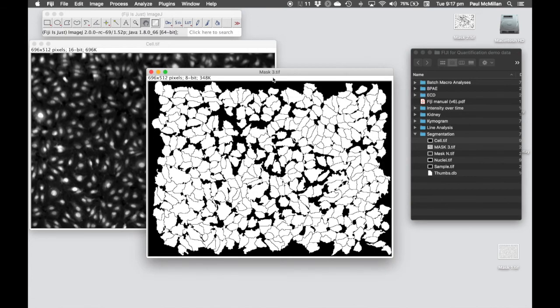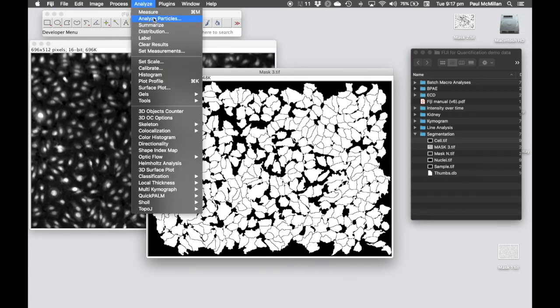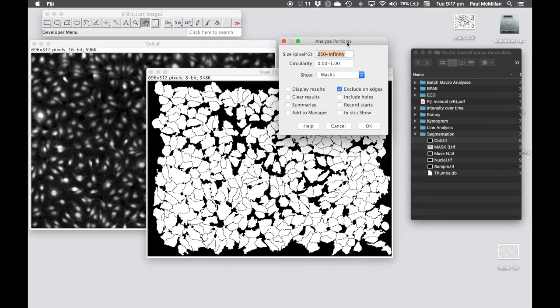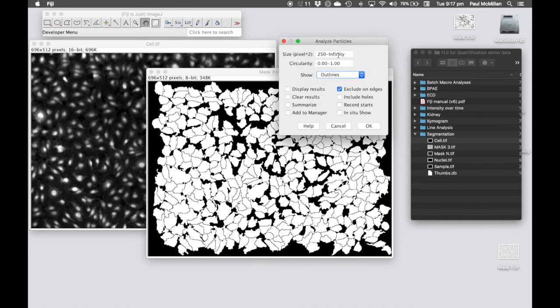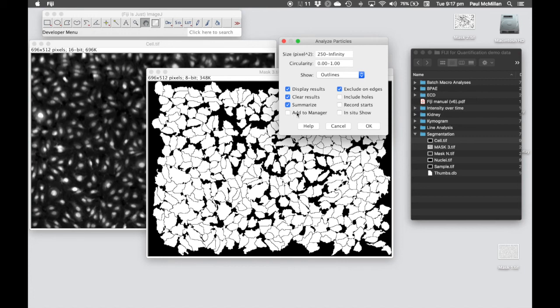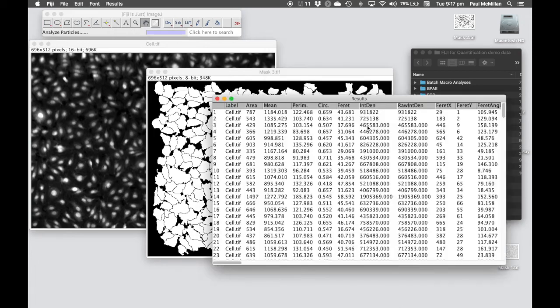Make sure we've still got our mask selected. We can then go back to Analyze Particles. Again we can use the 250 to infinity. In this case we want to Show Outlines. We want to Display Results, Clear Any Old Results, and also Summarize. We've got Exclude On Edges selected there, but that's already been cleaned up. You could also use Add to Region of Interest Manager if you wanted to go in and manually clean out some of the data as well. In this case we'll hit OK.